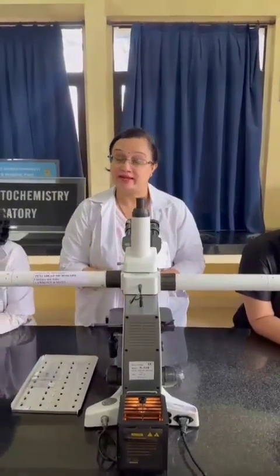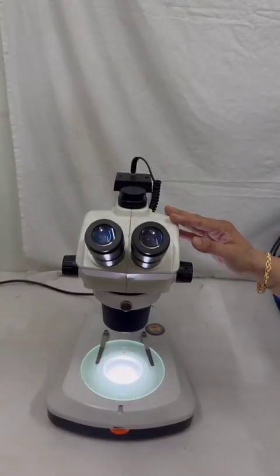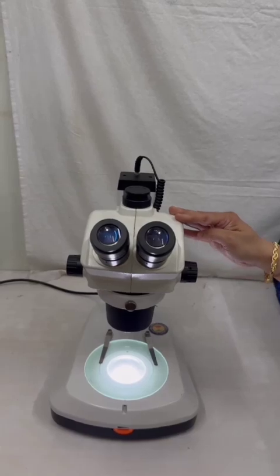Along with monocular, binocular and trinocular, our department has a unique pentahead. As you can see here, 5 people can see at one go. Now why is this important? Because this helps for diagnosis and also for teaching and learning purposes. With the pentahead, we are able to discuss, determine and give an accurate diagnosis of the pathology that is sent to our department. This is one more addition to our variety of microscopes in the department.